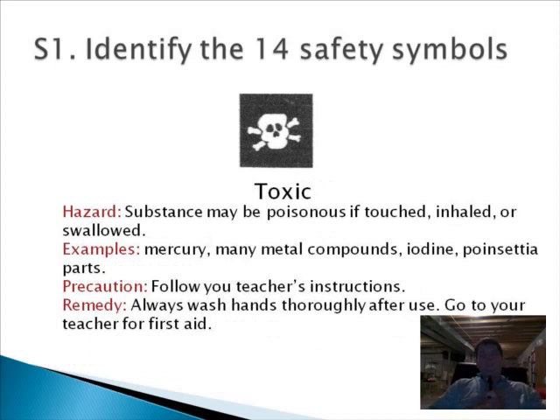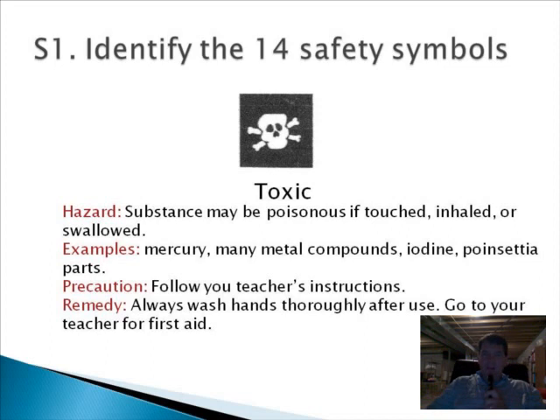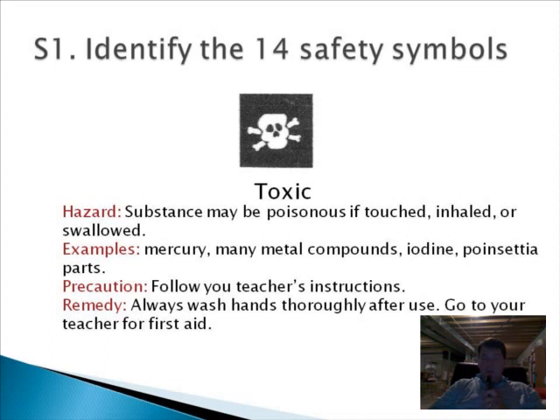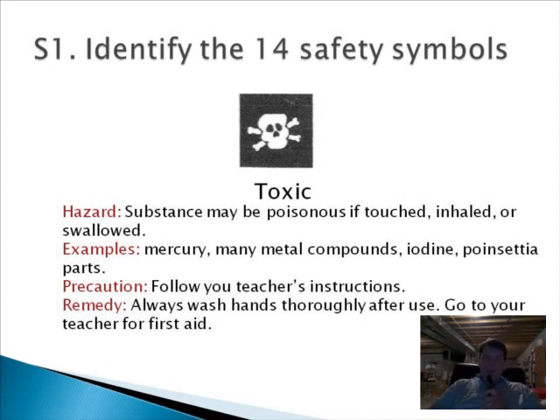The next chemical symbol is toxic — the most dangerous of our chemicals. This substance could cause death if, for example, swallowed. Common sense applies: you're not going to be drinking poison, but you need to be aware that it is dangerous and there's potential for getting sick. Examples include mercury, many metal compounds, iodine, and poinsettia parts. When we use these chemicals, we'll give you special instructions. Always wash your hands after the lab so you don't transfer any chemicals to your food.